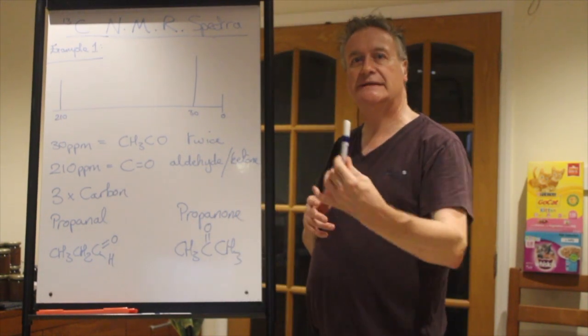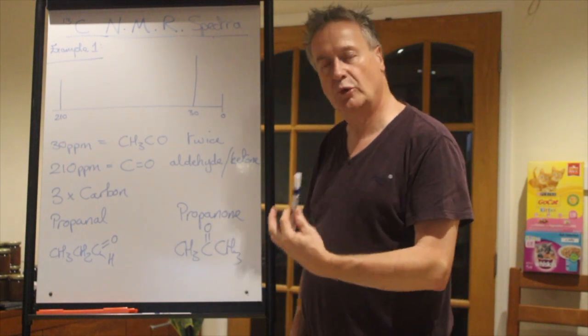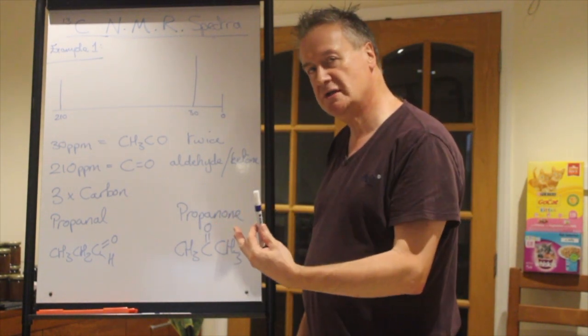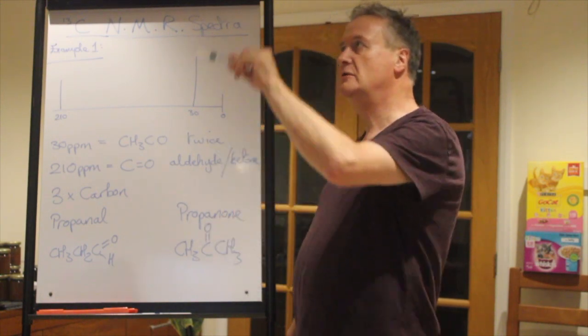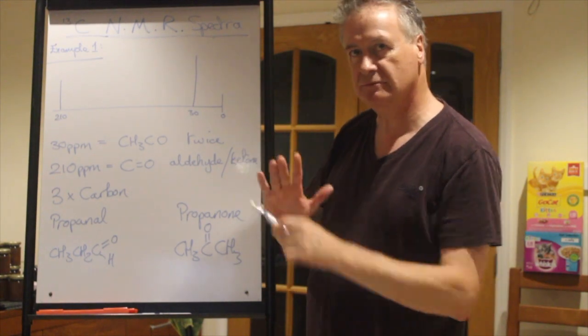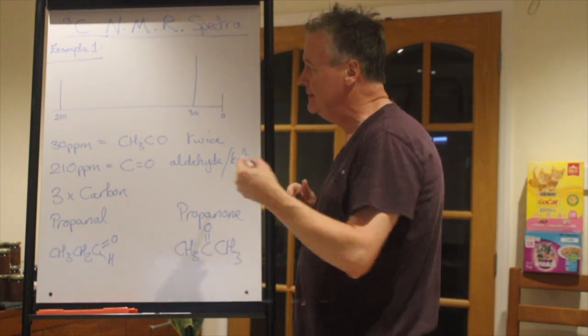You look up in the data sheet, and you'll need to maybe even pause the video at this point and look at the data sheet and go, what could 30 be? Find 30, look up across, vertically up, what boxes on that diagram does 30 go through?